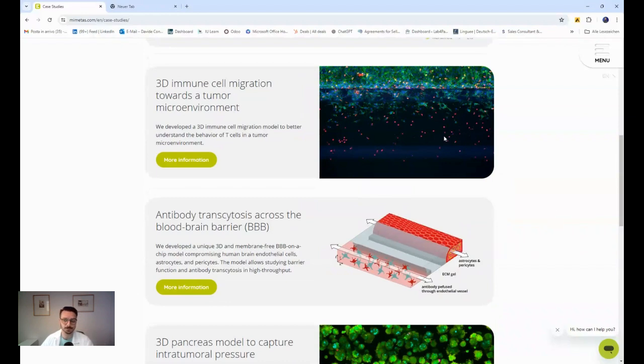In terms of microfluidic design, astonishingly, this is also really, really customizable, because, and they will explain it better, you can basically choose how many of these channels you want to vascularize.